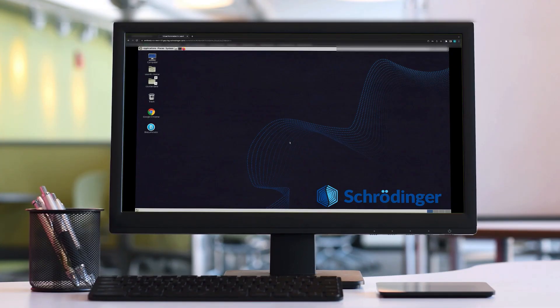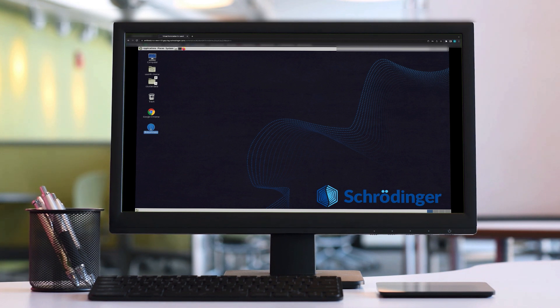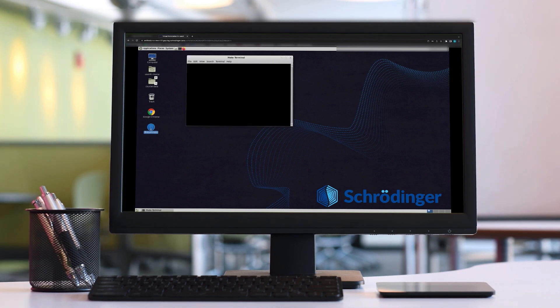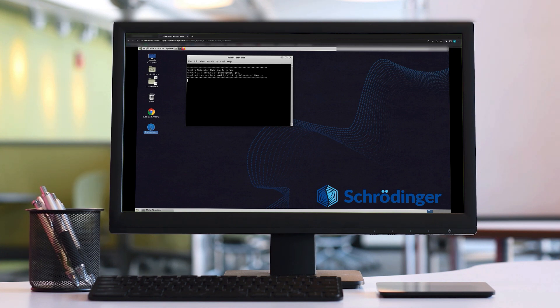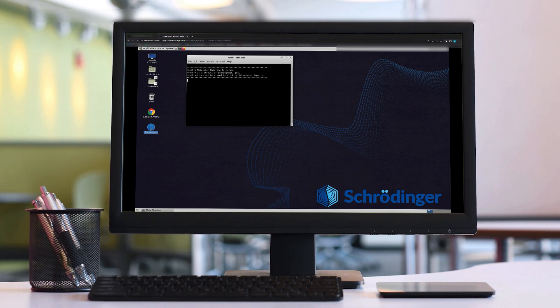Locate BioLuminate on the desktop and double-click to open. Just a note that it will be much easier to navigate and perform tasks in BioLuminate if you are using a three-button mouse with a scroll wheel, as opposed to a trackpad or trackpad mouse, such as an Apple Magic Mouse.